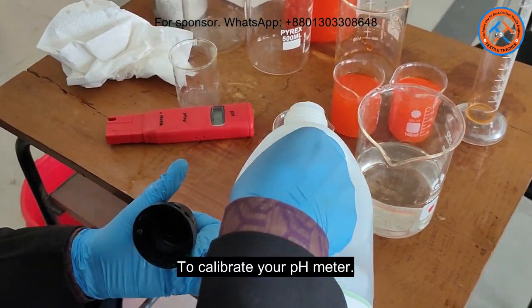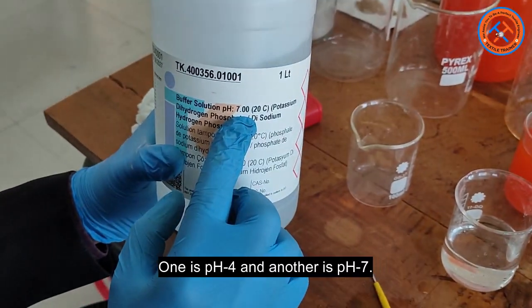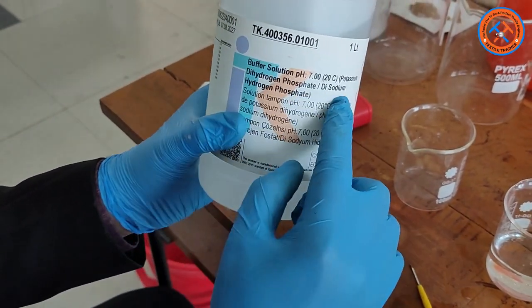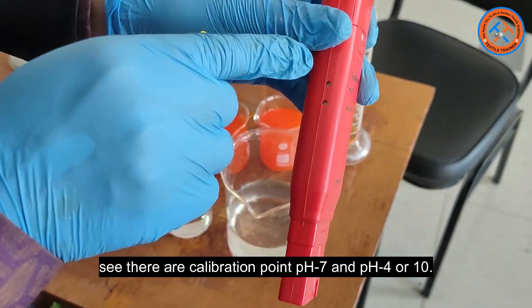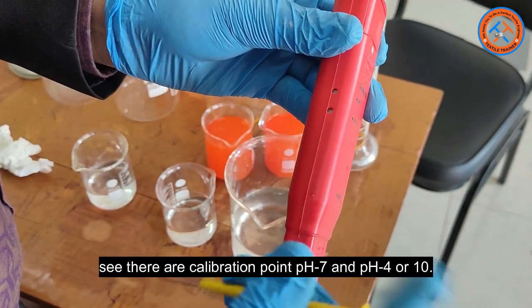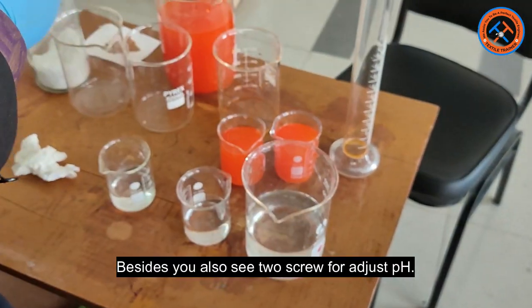To calibrate your pH meter, you need two buffer solutions — one is pH 4 and another is pH 7. At the back side of the pH meter, you will see there are calibration points: pH 7 and pH 4 or 10. Besides, you also see two screws to adjust pH.